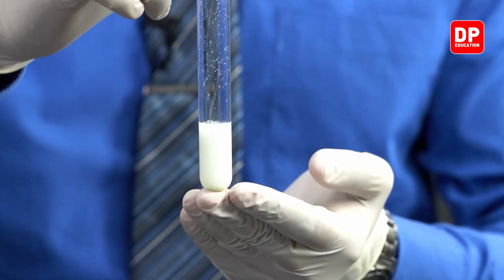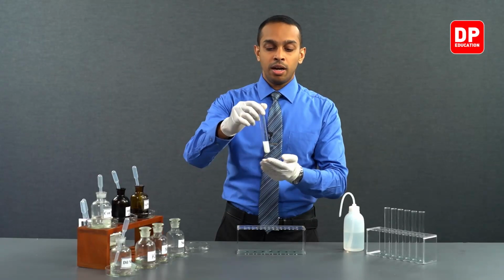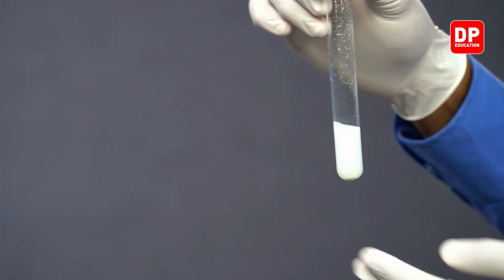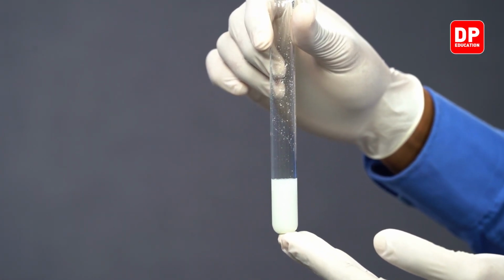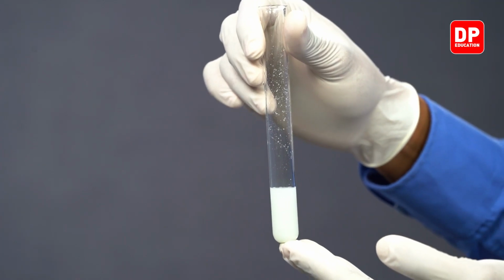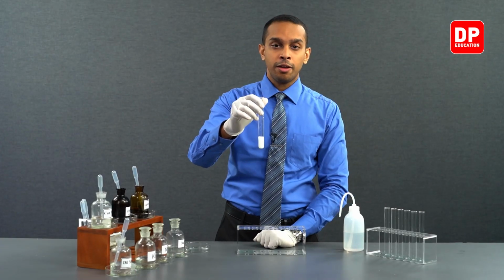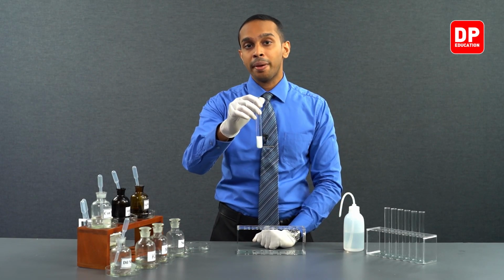We'll compare the colors later on to silver chloride, silver bromide, and silver iodide. But in this case, you can see the precipitate that is formed is going to be a pale yellow color. It is quite difficult to properly distinguish it from white color. But if you compare it against silver chloride, you will very clearly see that this is a pale yellow color.